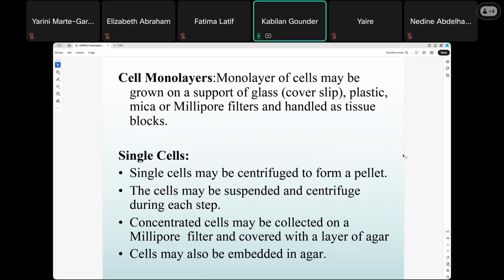The easy way to address this is you can centrifuge every time after you process. Then you remove the supernatant or whatever chemicals, then you add new ones, mix, incubate, and move forward. That's the way you can process your samples with different materials or different tissues.